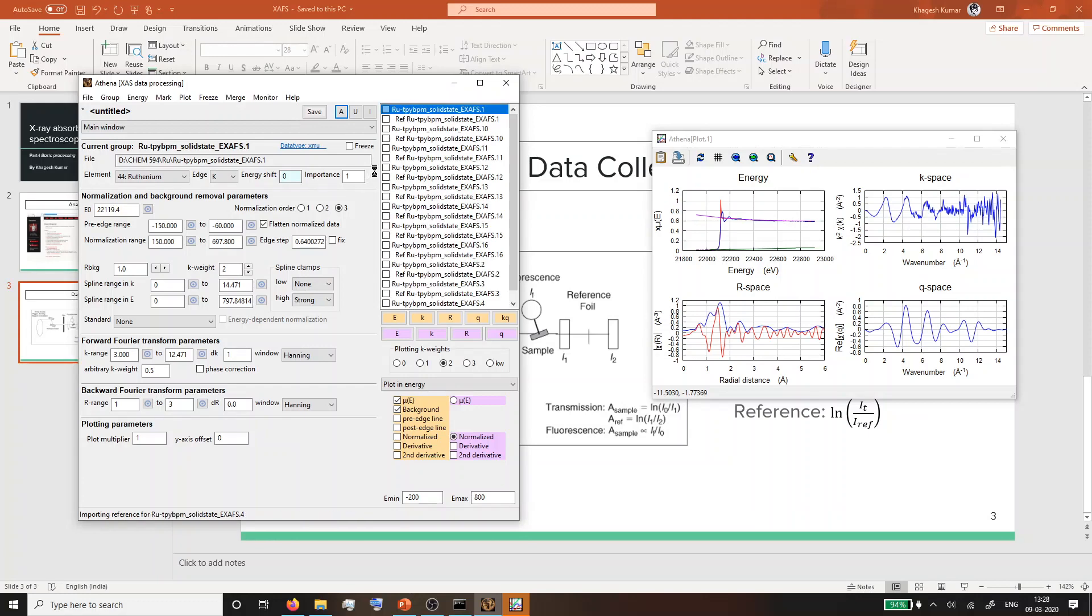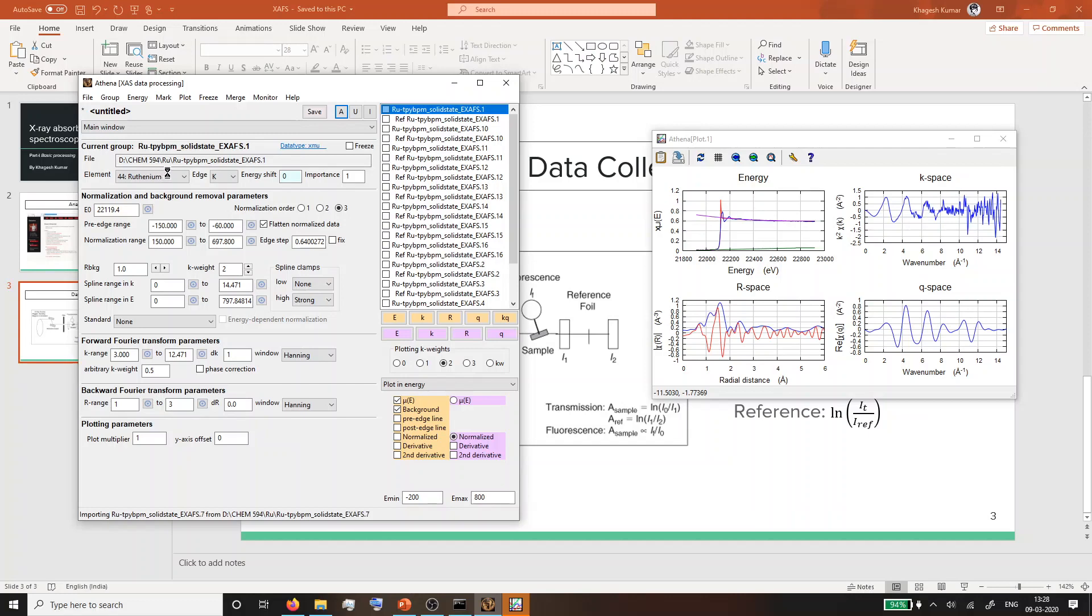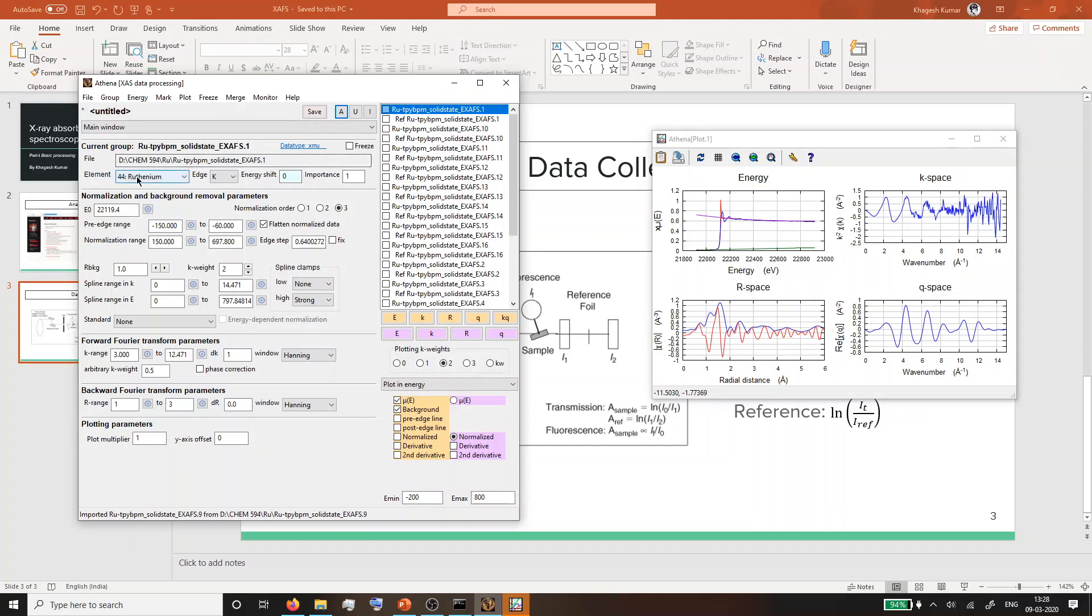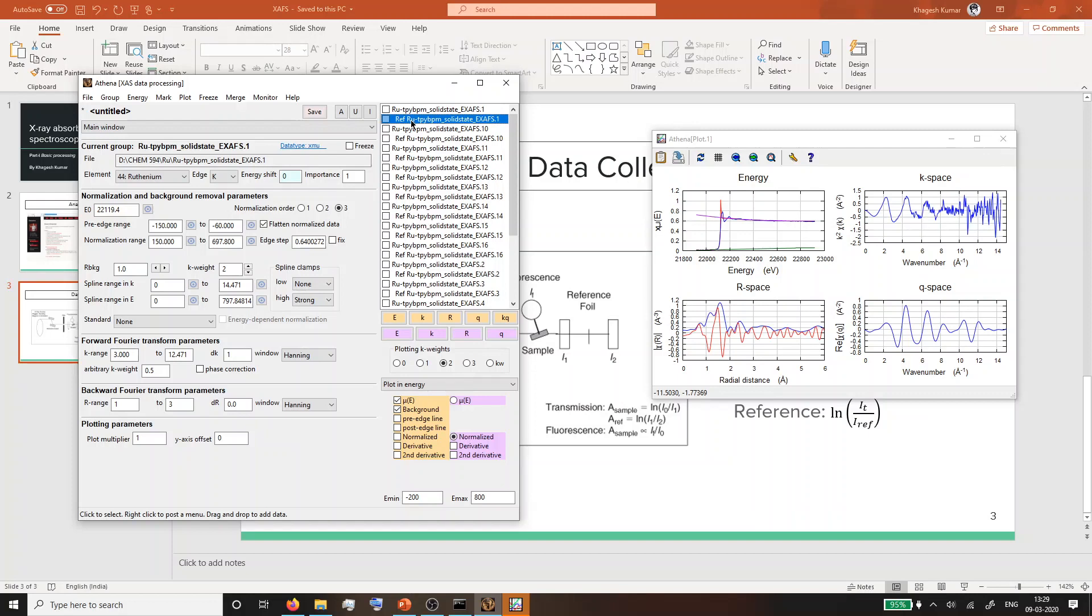The first thing you should look at while you load the data is if the element shown here is the element you want to work with. This sample is indeed ruthenium K edge, so that's good. Otherwise you might have to manually change this to the element of interest, and this matters downstream when you are doing further analysis. The second thing - as we talked about, energy might not be at the right position. As we have loaded the reference channel, each file will have a reference file associated with it. Any energy alignment or calibration you make on the reference channel will affect the main file.